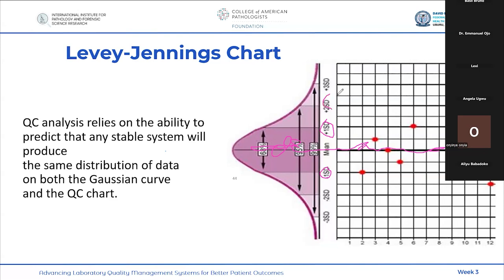and plus 2 SD. So remember, we said that this occurrence is a normal one, and anything that is outside means that something is wrong with the system. And when that happens, it has to be investigated.